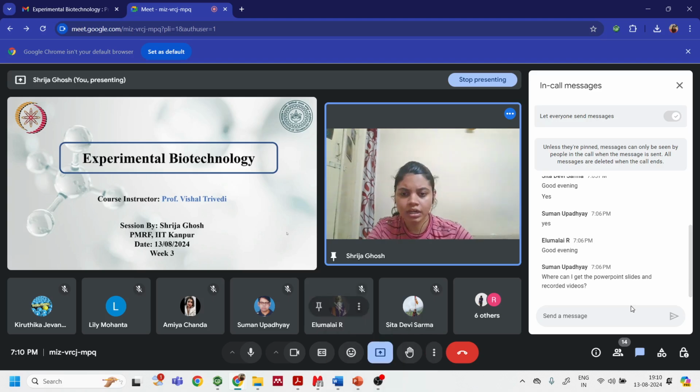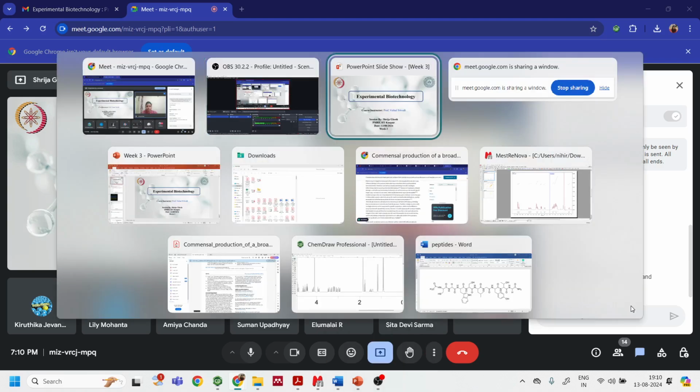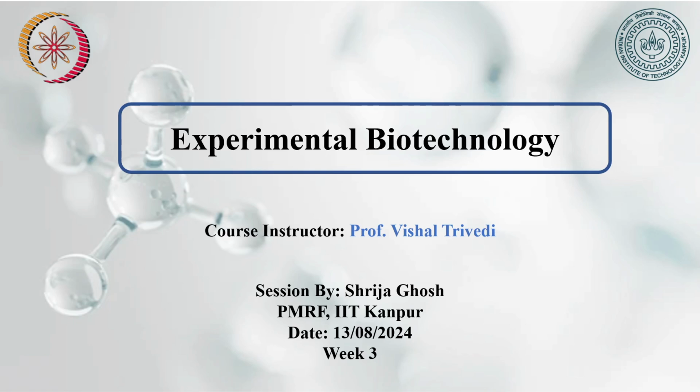Let's start the class now. So today is the third problem solving session for the course Experimental Biotechnology. Today we will discuss more deeply about electrophoresis, some different techniques of electrophoresis. So previously in the last session we discussed about vertical and horizontal electrophoresis, how to separate proteins and DNA majorly.